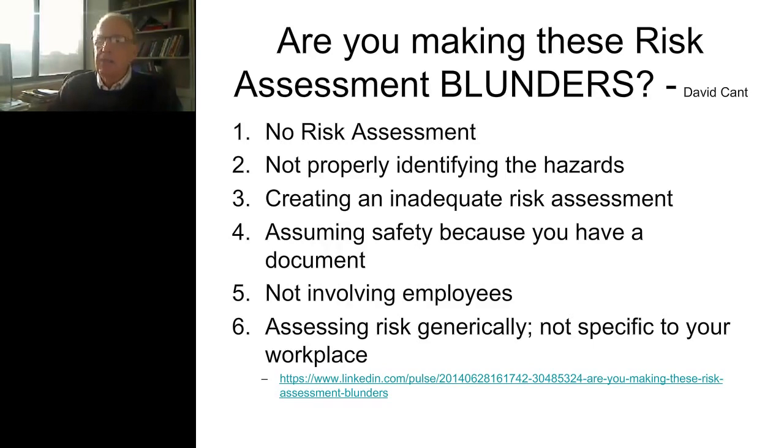But you also have to consider the processes in use with a MALDI-TOF. For example, if you're doing direct spotting, you're not going to be killing the organism. So consequently, you have to be concerned, what if that's a highly pathogenic organism that you're using? Maybe you want to use the tube method to kill the organism.